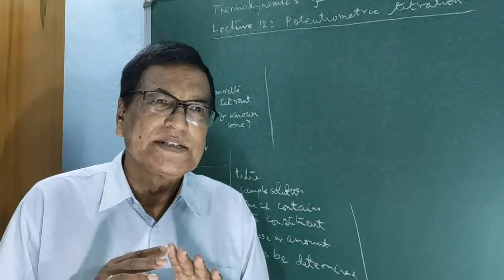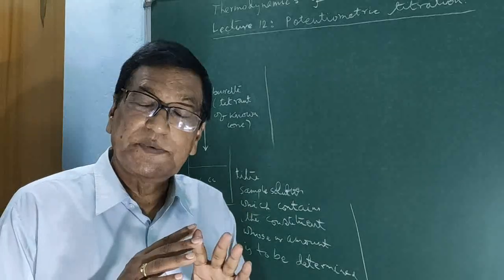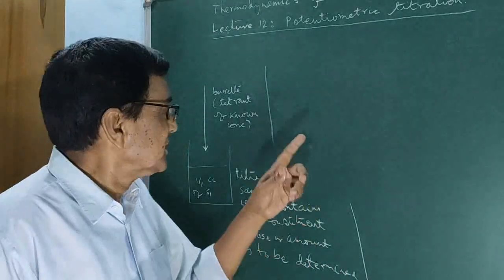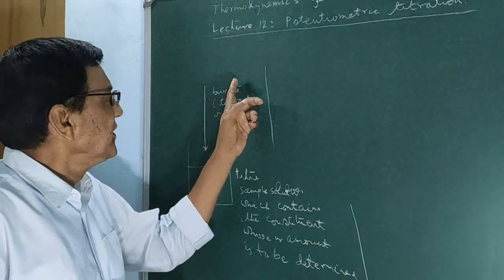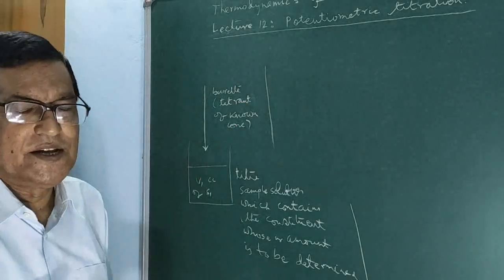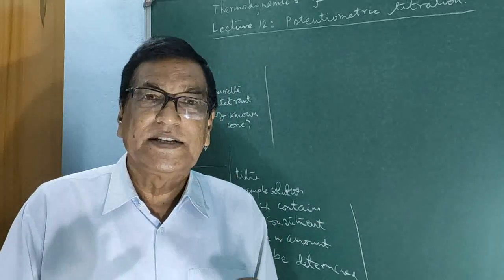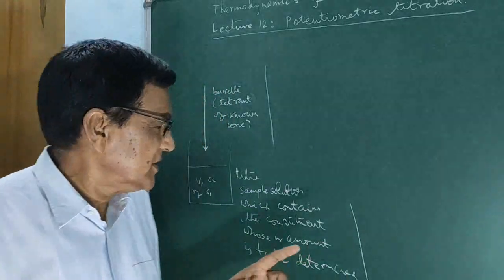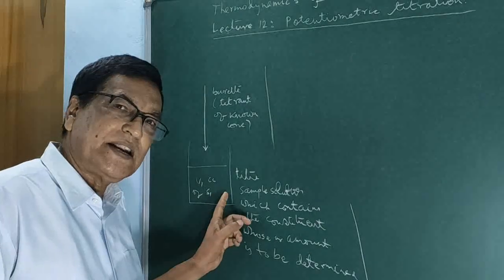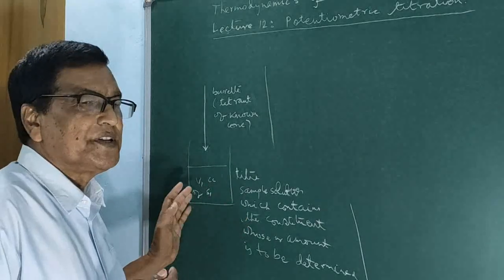Or in some cases, the conductance of the titer solution is measured from time to time with gradual additions of titrant from the burette. And in other cases, the electrical current passing through the solution is utilized to determine the end point.